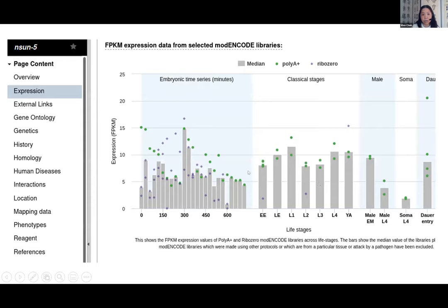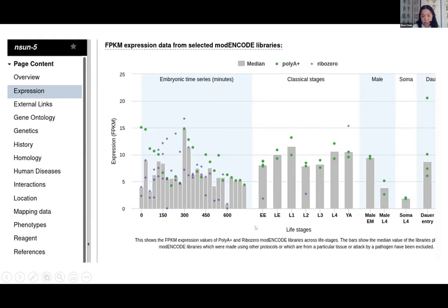WormBase also has an in-house display of RNA-seq FPKM expression data selected from modENCODE libraries. Also under the expression widget, you can see how expression levels change across developmental life stages. These RNA-seq data are derived from modENCODE and remapped to the current genome in every build. Users often ask us: 'How can we download the expression values used to build those expression graphs?'